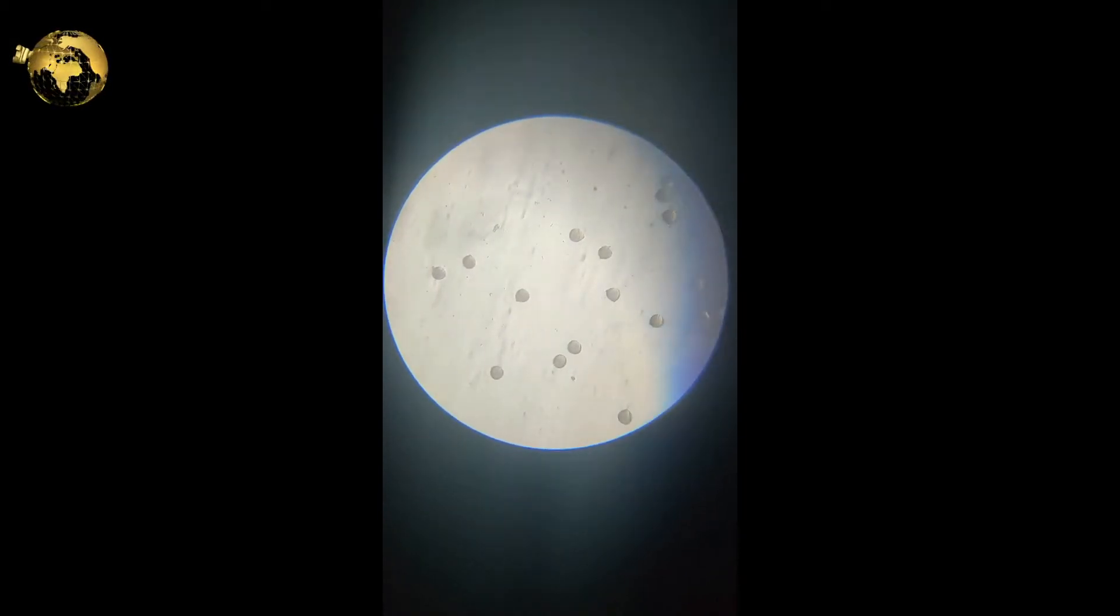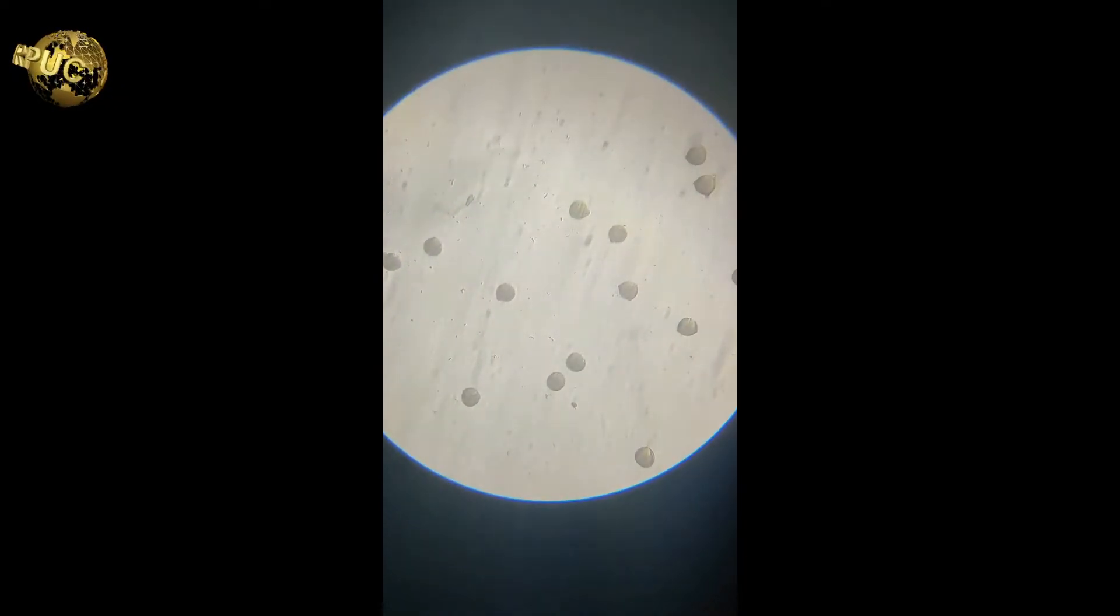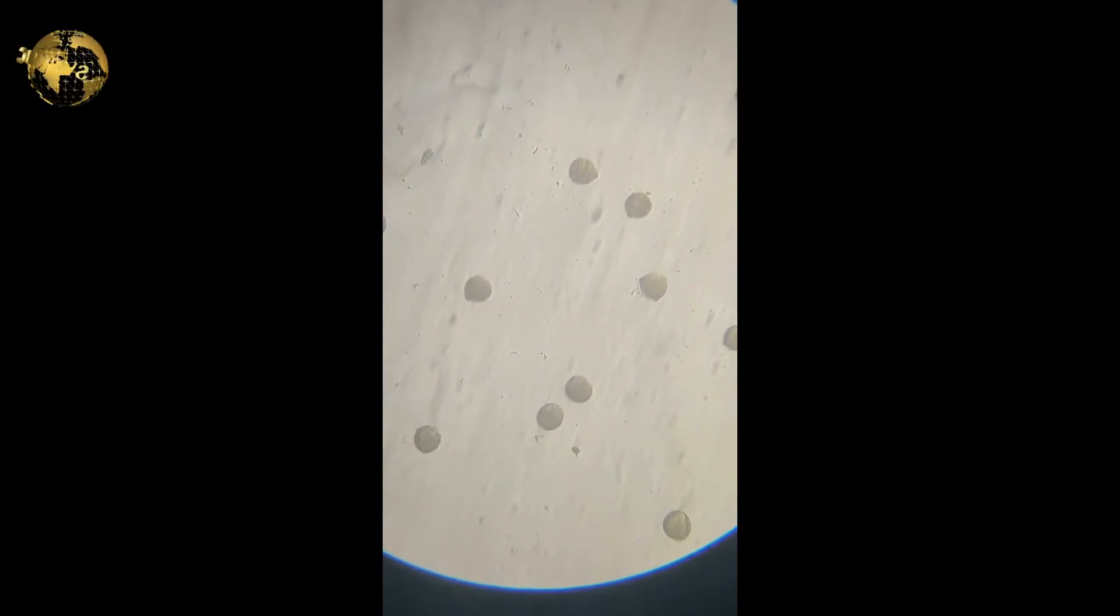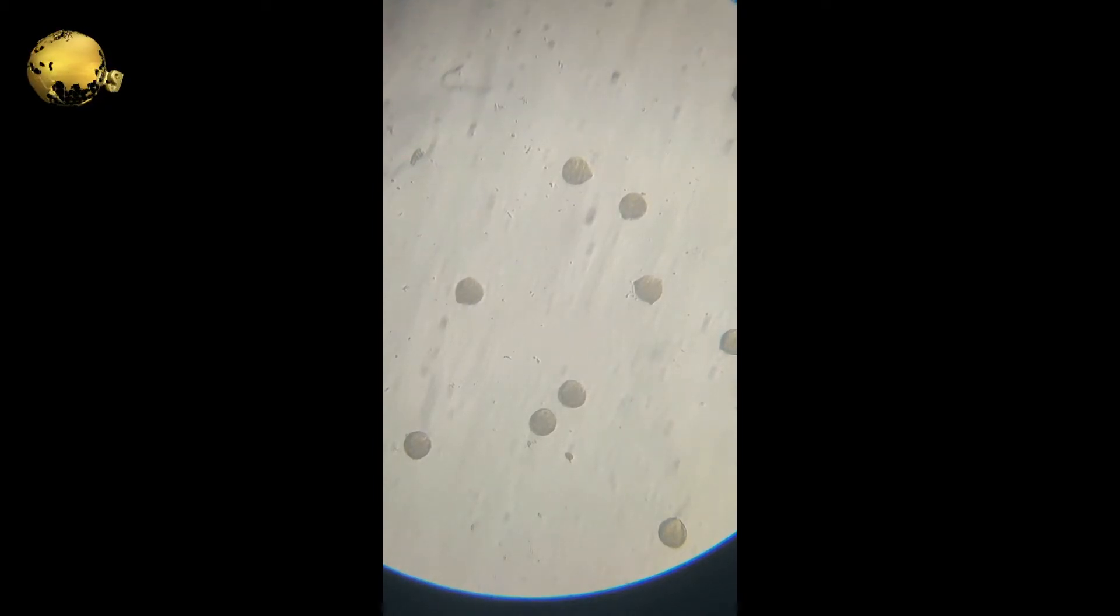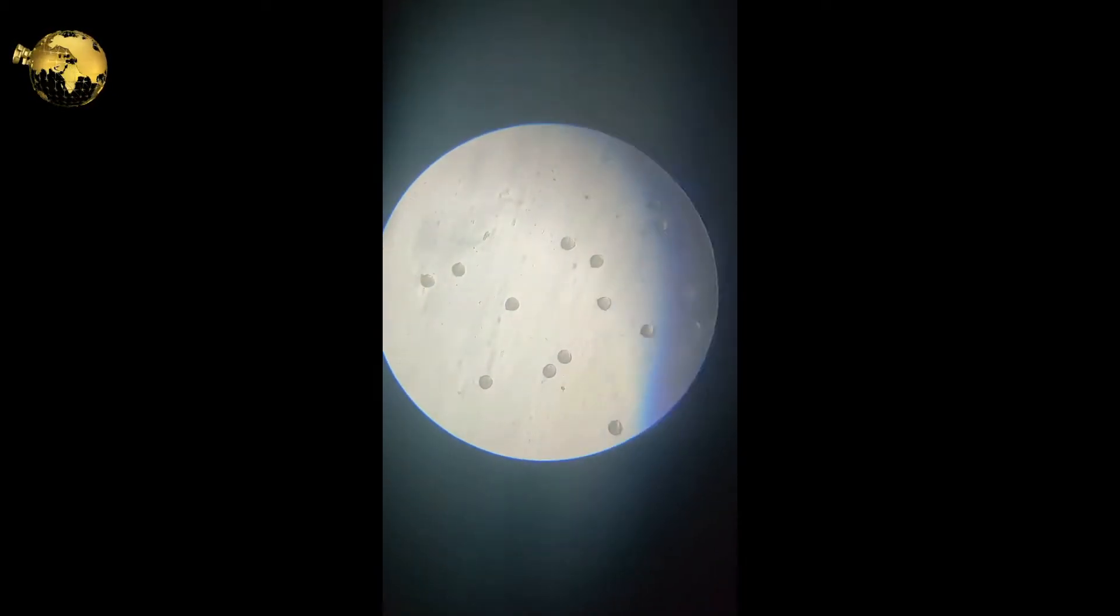The pollen grain is uninucleated in the beginning. At the time of liberation, it becomes two cells with a small generative cell and a vegetative cell. Later in the nutrient medium, the pollen grain germinates and forms pollen tubes.